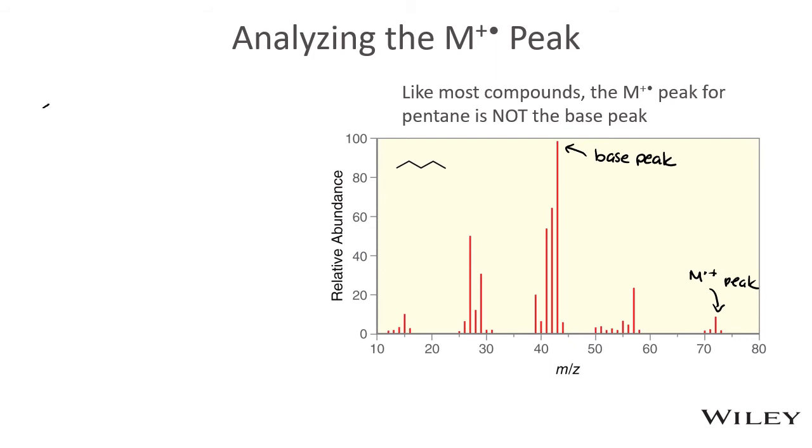Now, if we take a look at pentane, and for all molecules in general, anywhere there's a bond, we can consider it being capable of fragmenting or breaking. So we can consider a fragmentation between 4 carbons and 1 carbon. That could lead to two possible scenarios.